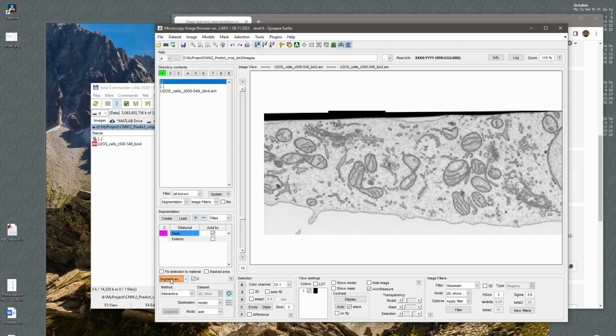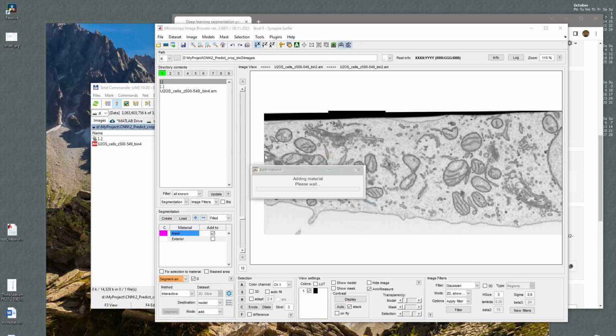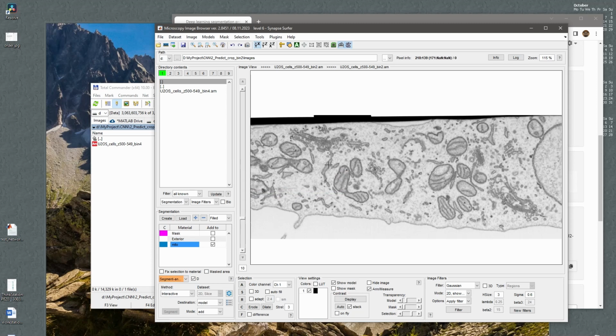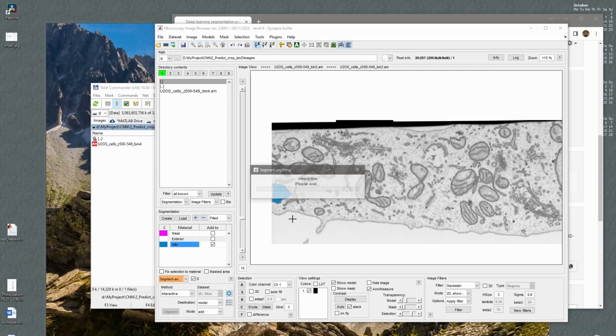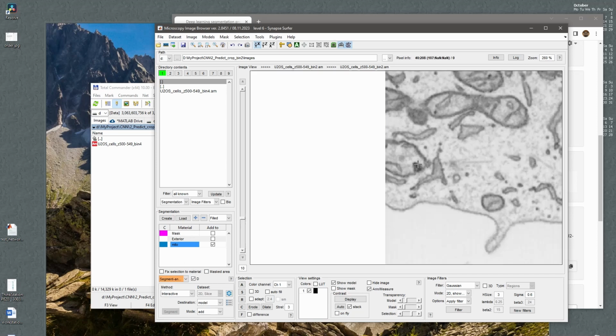There is another video where you can find how to install it and how to use it. But mitochondria are a really nice target for this, and I can quickly create the ground truth training set. What I do is basically click on my mitochondria to select them and assign them to my material.